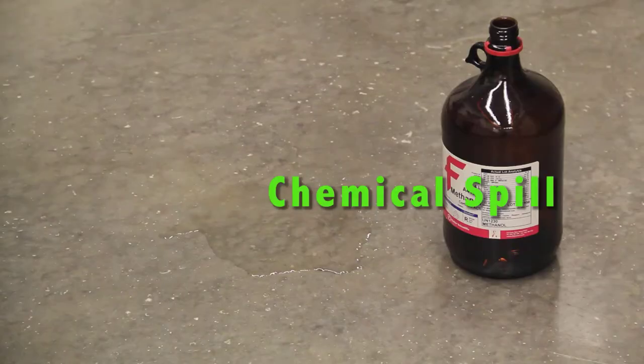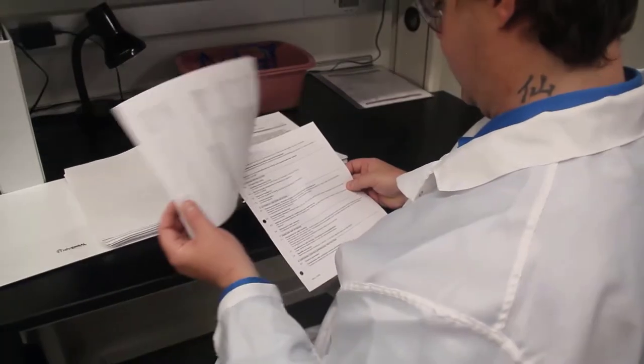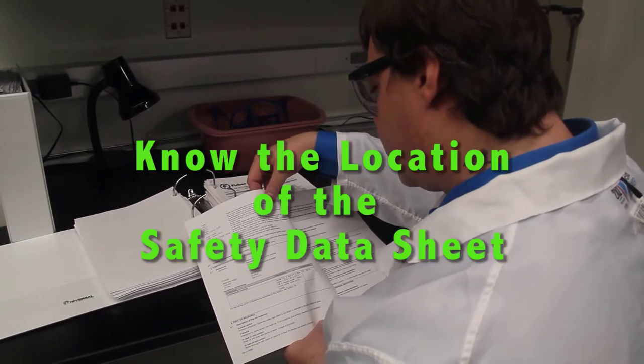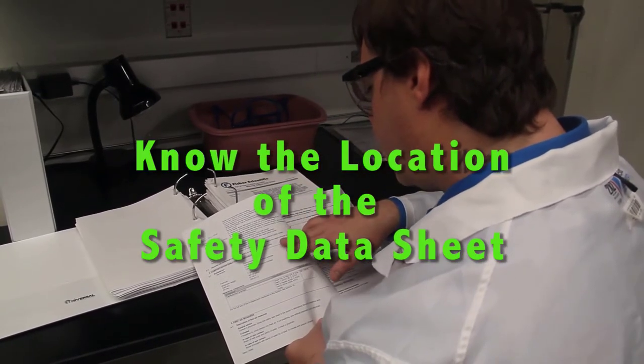Should you encounter a spill like this one, the first thing to do is to consult the materials safety data sheet for the chemical involved. Everybody should know the location of the SDS and how to use it.